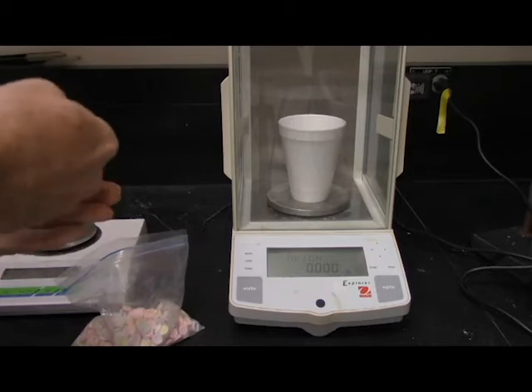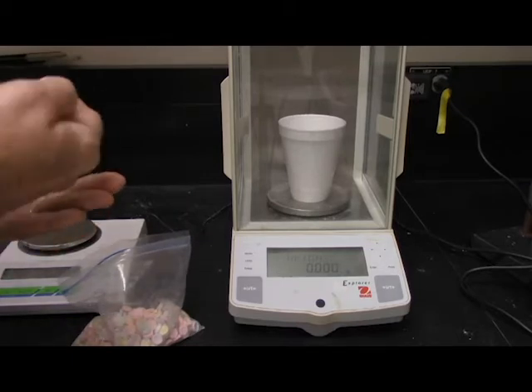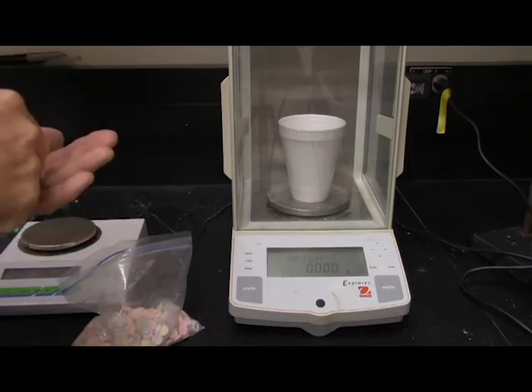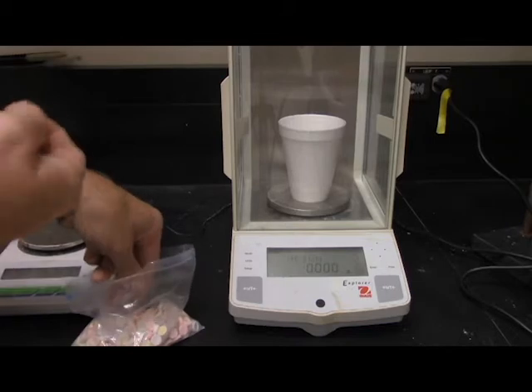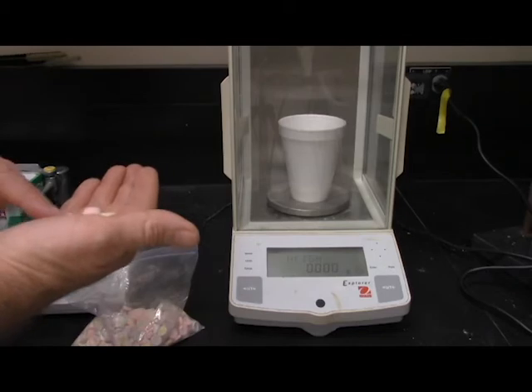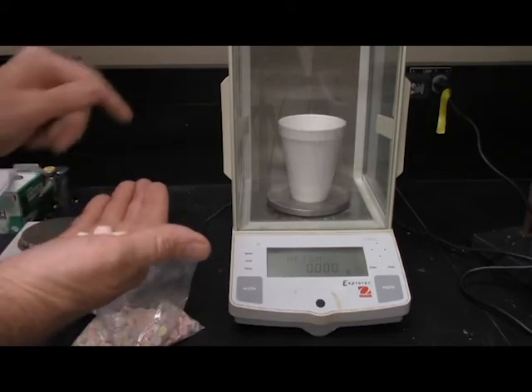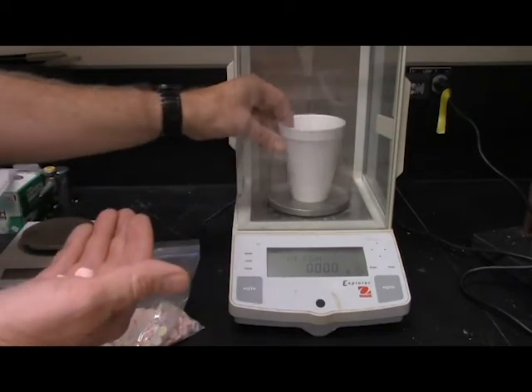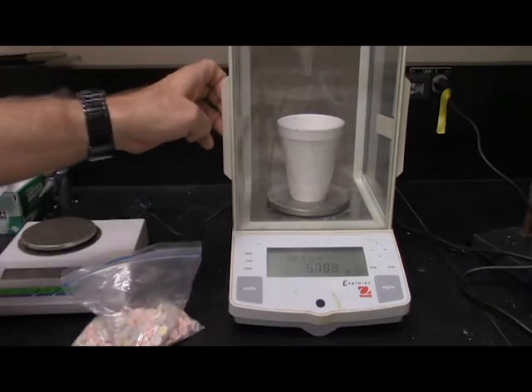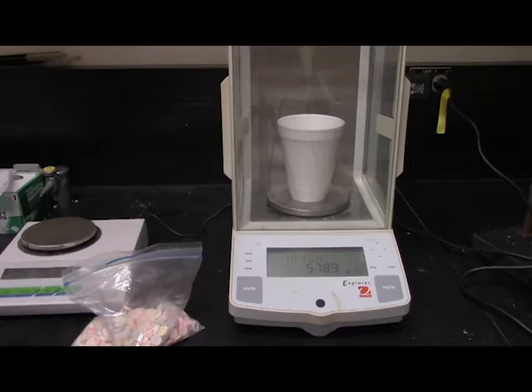1, 2, 3, 4, 5, 6, 7, 8, 9, 10, 11, 12. One dozen Smarties here. We put them in there and we weigh them. And we have our first measurement, 5.785 grams per dozen Smarties. And of course we dutifully write that down in our notebook.